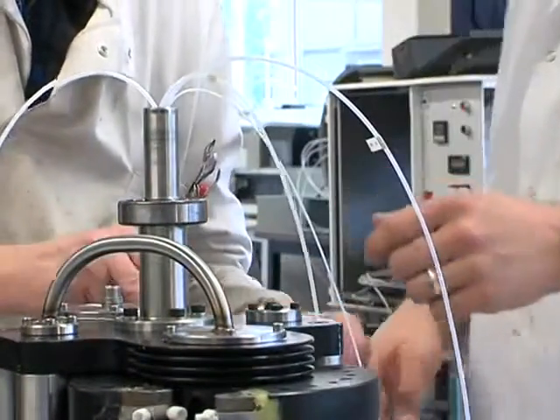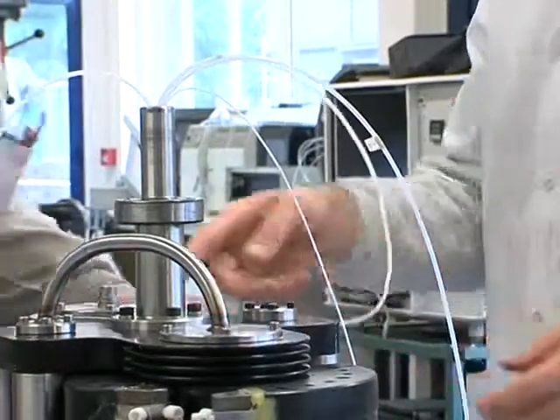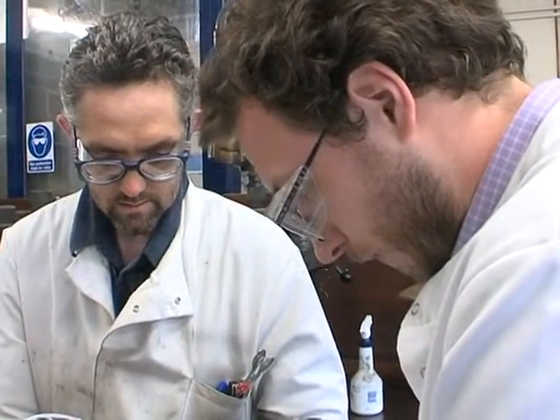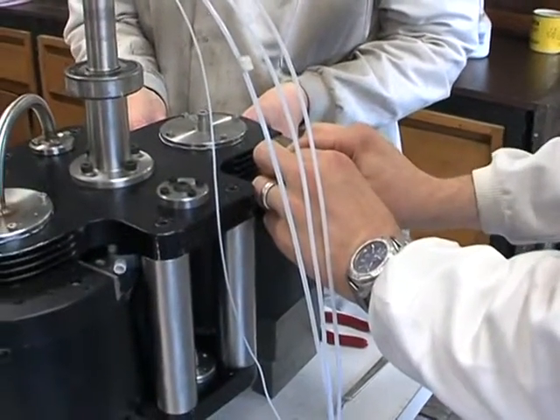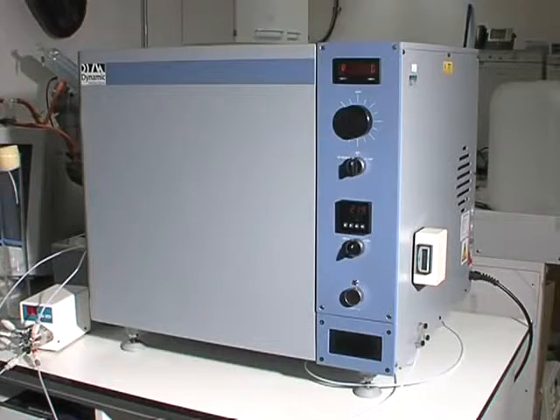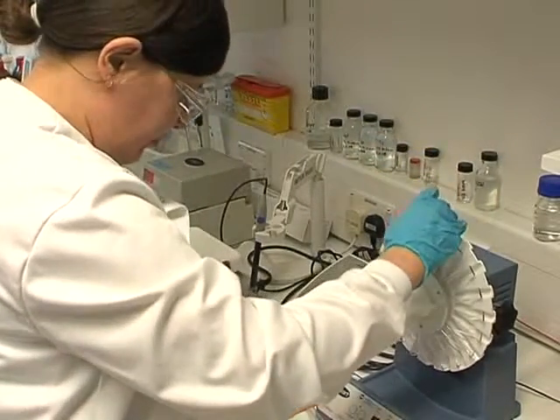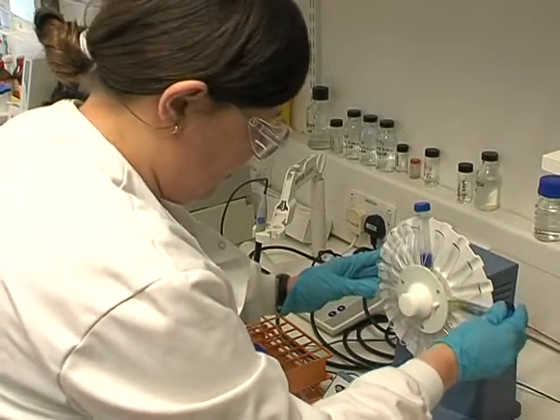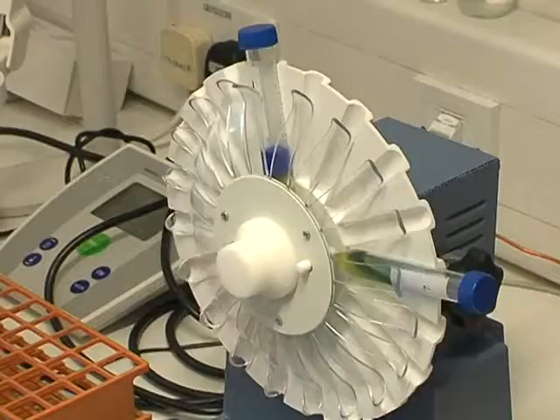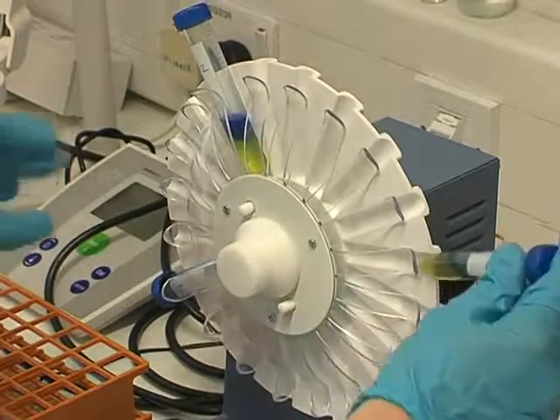On the one hand, engineering developments on the old J-type centrifuges have produced robust machines capable of separations which are fast, efficient, and able to accept extremely high loadings. On the other hand, developments in the application of the technique have produced protocols and solvent selection tables that make the determination of the separation conditions and the running of the instruments systematic and simple.